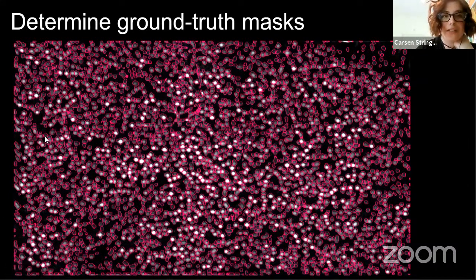And actually, fun fact, this is the first thing I was trying to segment before we started building Cellpose, and it wasn't working so well. And we were like, oh, well, maybe we actually need something better to segment these cells. But anyway, now using Cellpose, I'm pretty happy with the segmentation we can get, and we can finally start to work with this data.